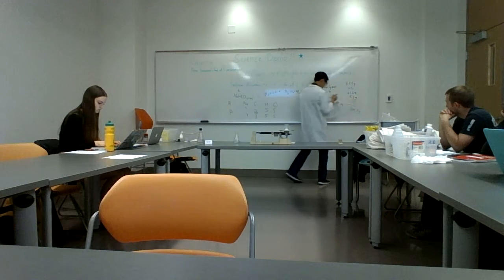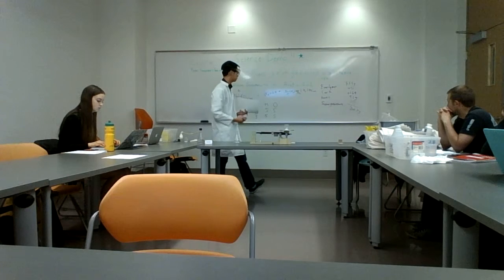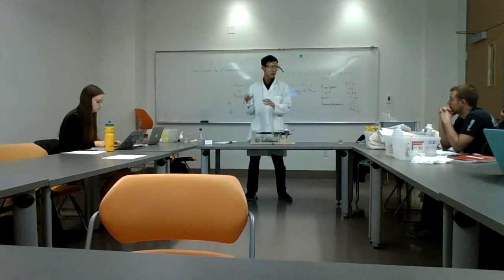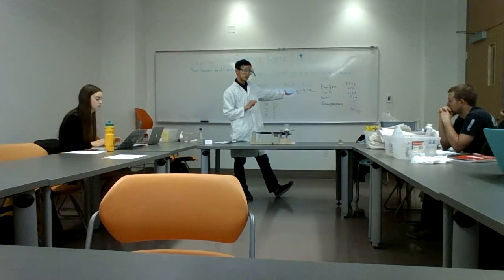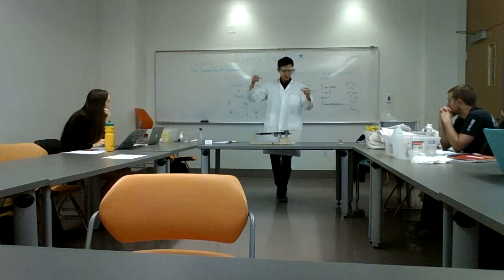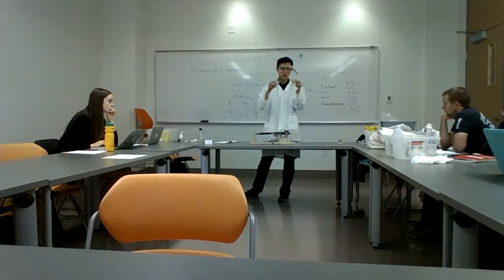Okay. So with this, let's see what will happen right now when we mix it, and you guys are going to predict what the mass of our product will be, and explain why it would be what it is. I'll give you a couple of minutes. What do you think happens when I mix the baking soda into this Erlenmeyer flask, and what's the total mass? I think it'll be the same. So you think it's going to be 201.7 grams, correct? Let's double check this. Let's take this right here, and I'll put it in here, and we'll see what happens. Also, when you guys are doing this, please observe and write down anything you see as the result of a chemical reaction.